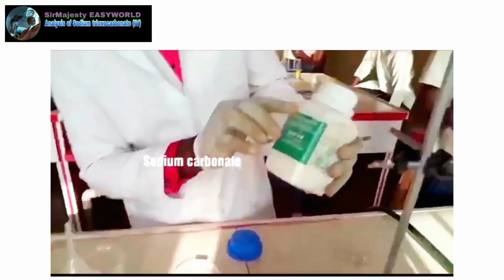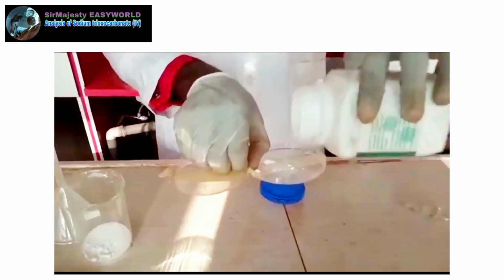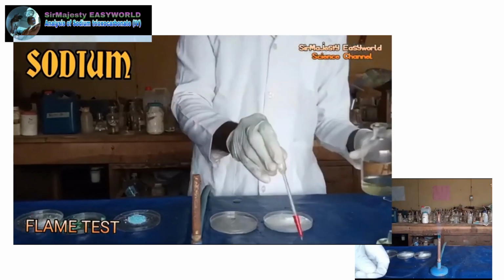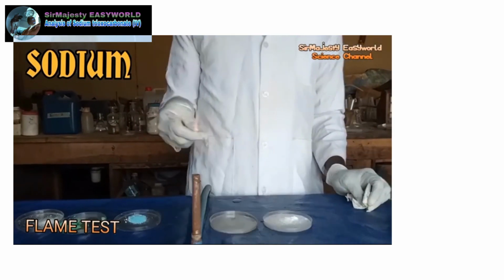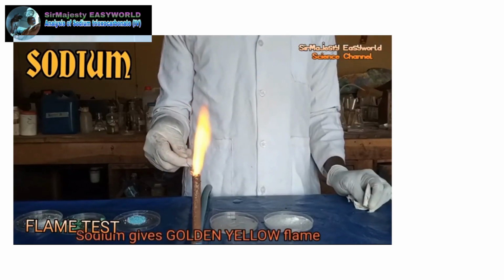Then you will be required to carry out the flame test, of course, to confirm the presence of sodium ion. In the flame test, you are required to take about half spatula of C. You put it in a watch glass and add drops of HCl, then dip the tip of a clean platinum wire into it and hold under a non-luminous flame. The positive result for sodium ion in flame test is golden yellow flame. So sodium gives golden yellow. If you observe this golden yellow flame, in your inference you write sodium ion confirmed because it is the ion that gives golden yellow.